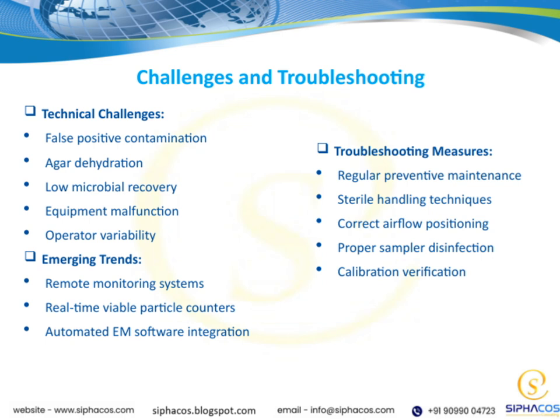Equipment malfunction can disrupt our entire workflow, so regular checks and maintenance are vital. And operator variability reminds us that training and standard procedures are essential to keep results consistent across different personnel. Looking ahead, there are exciting emerging trends to consider.